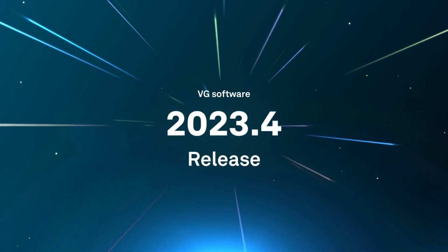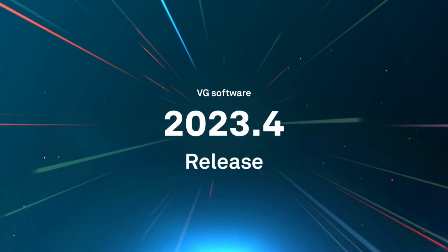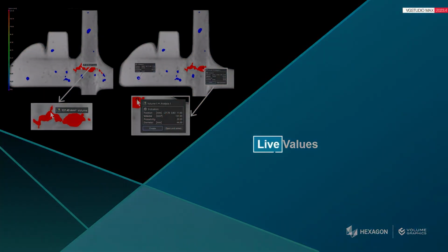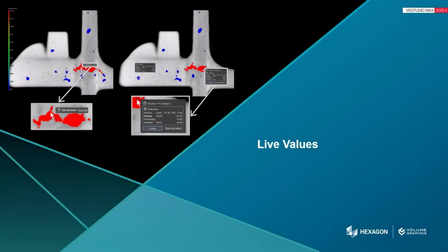Hey nerds! For our latest version, we've once again left nothing on the table to deliver some solid highlights to you, like real-time insights with live values. You heard right, real-time. No fiddling around in the menu, everything live and right at your fingertips.